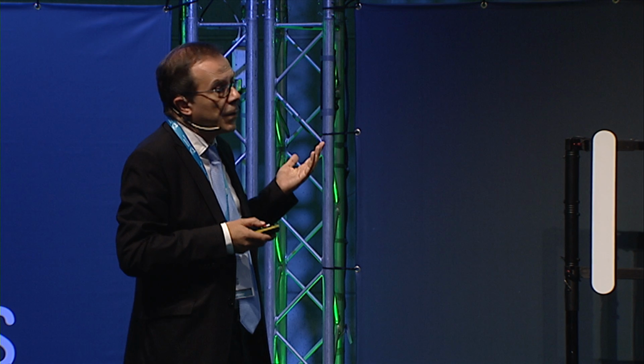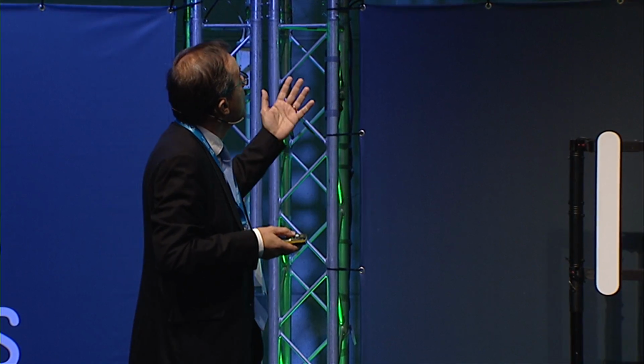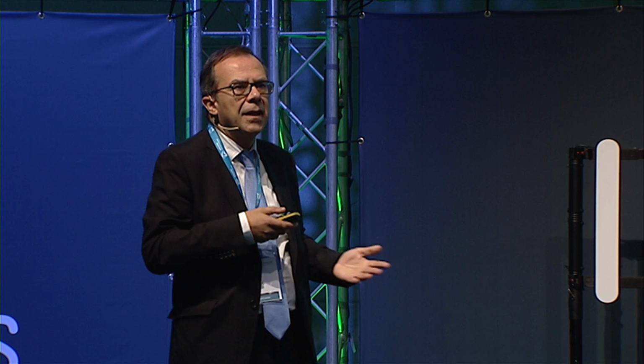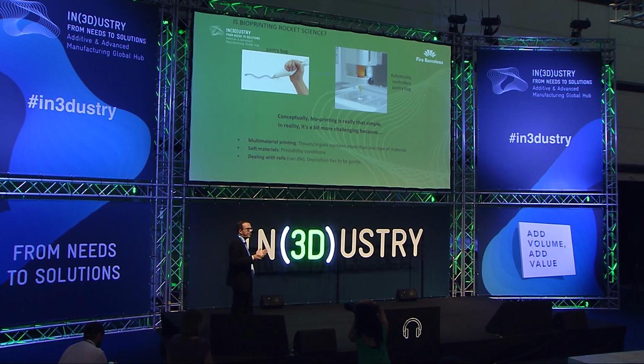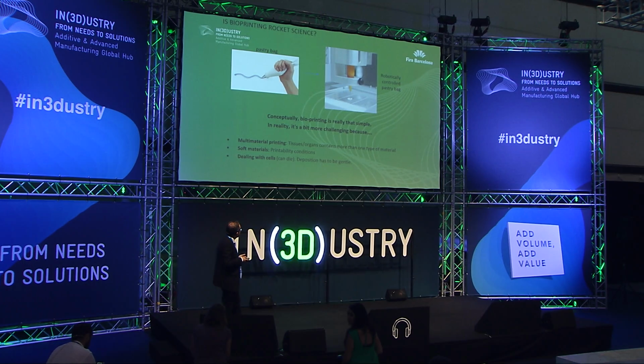So in principle, the idea of 3D bioprinting is very similar to 3D printing. So more or less, it tries to obtain a mixture introducing the material and the cells, and to use a robotically controlled pastry bag, and that's more or less similar to the usual 3D process.